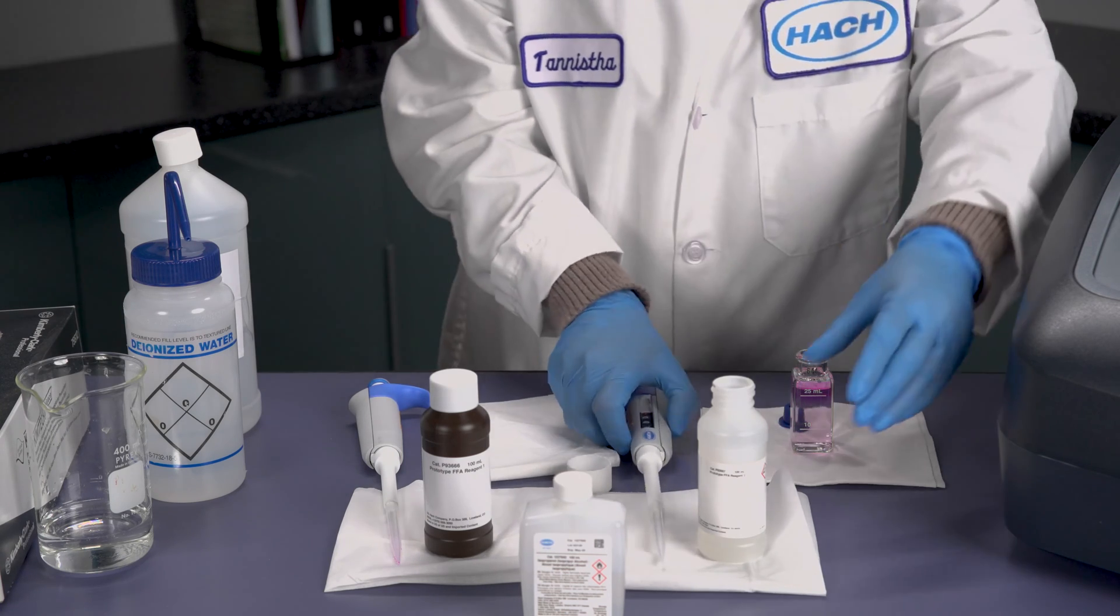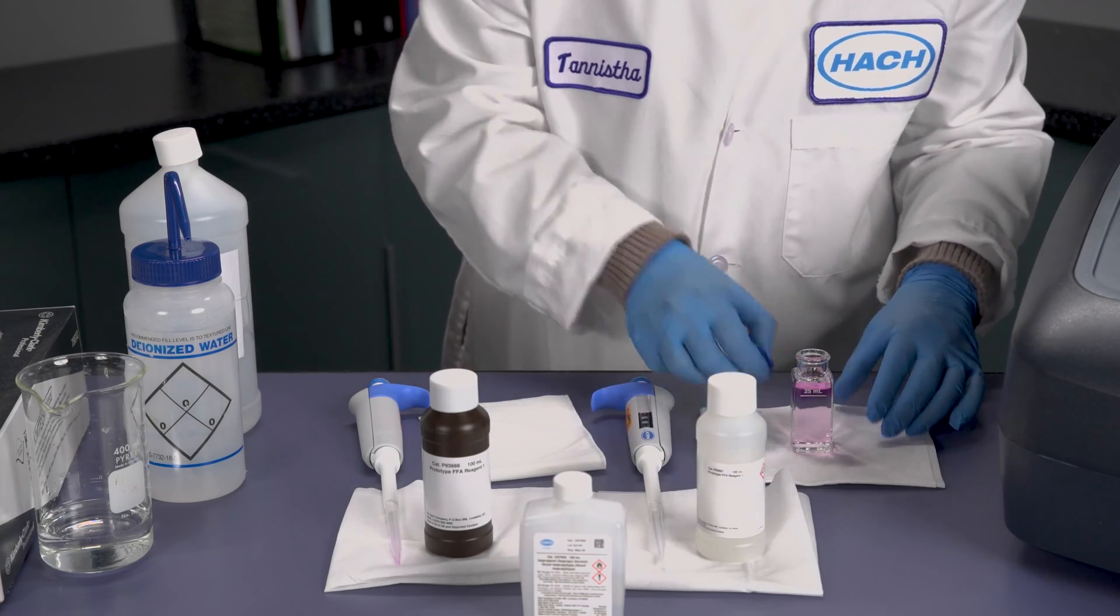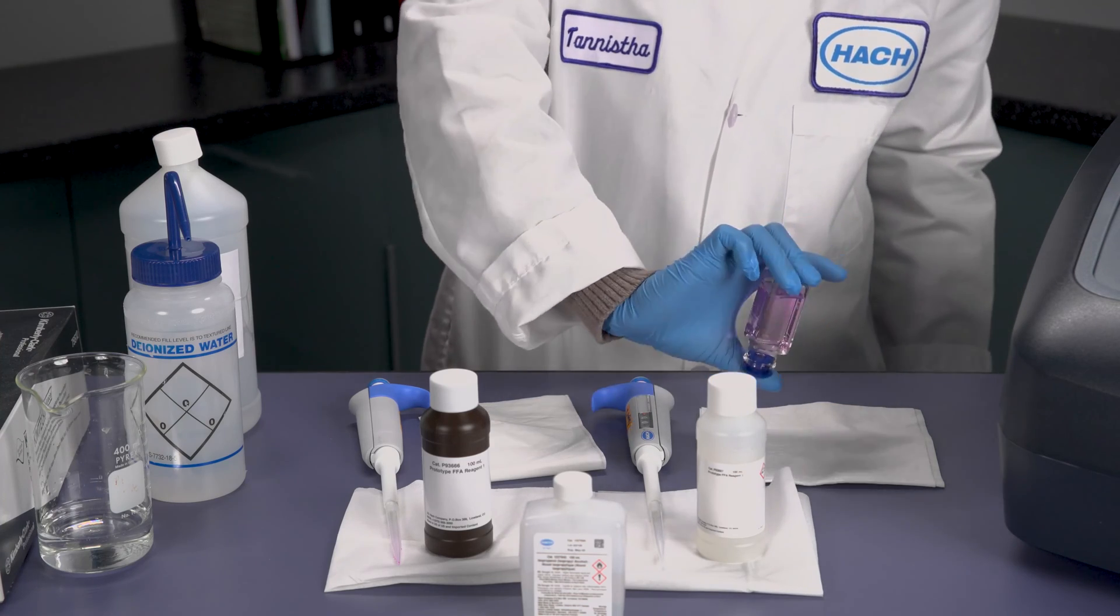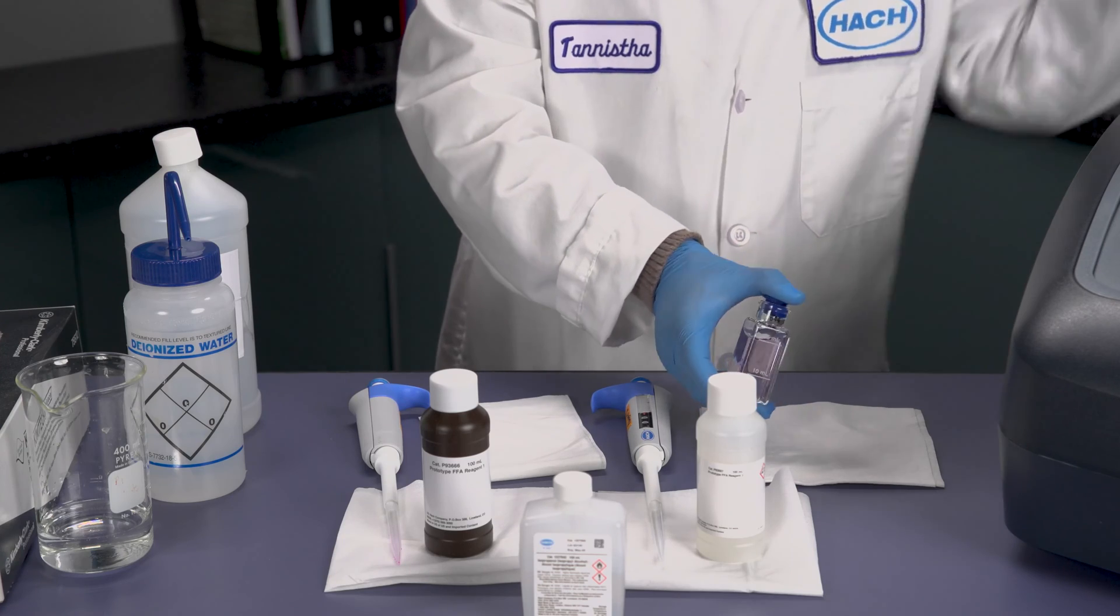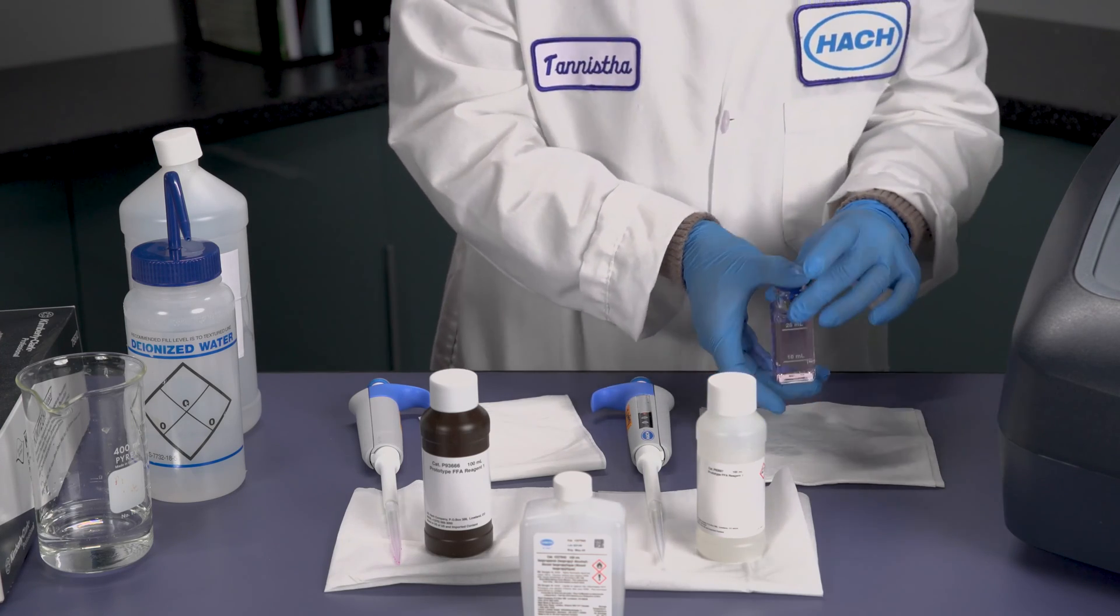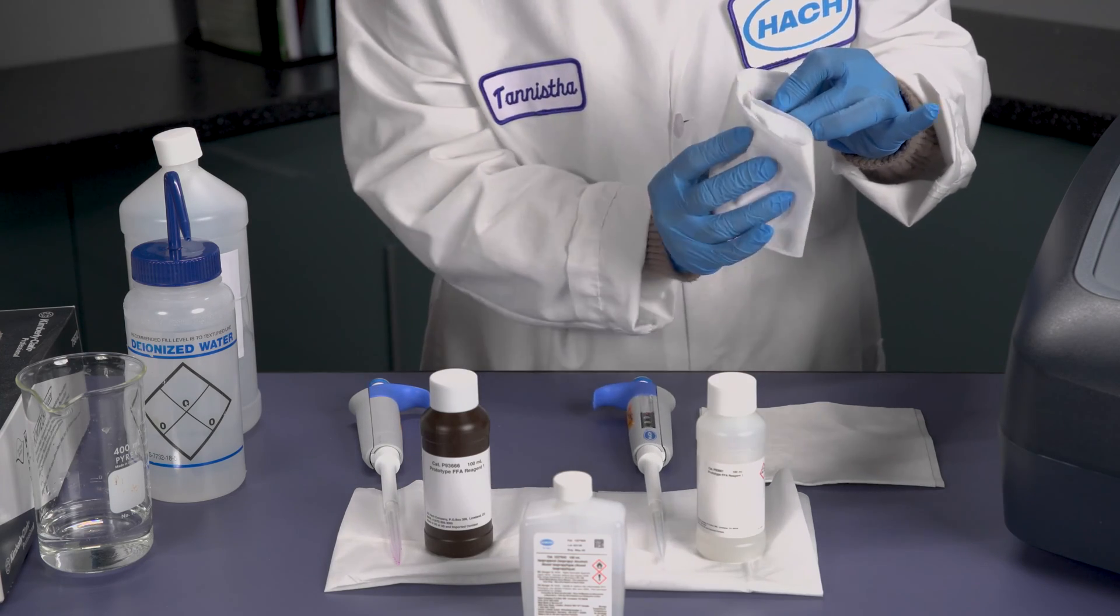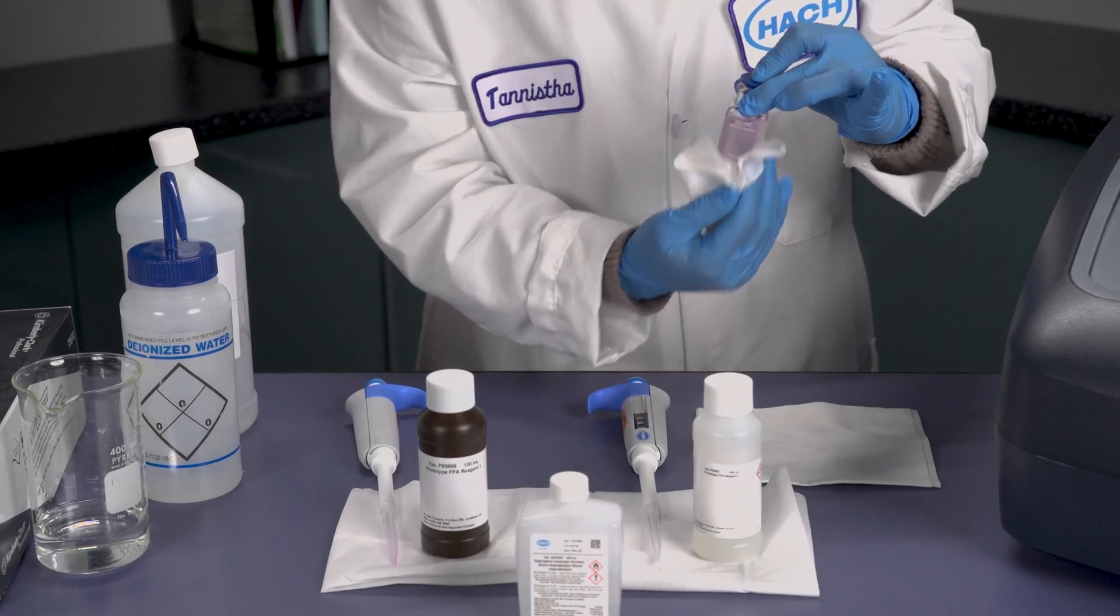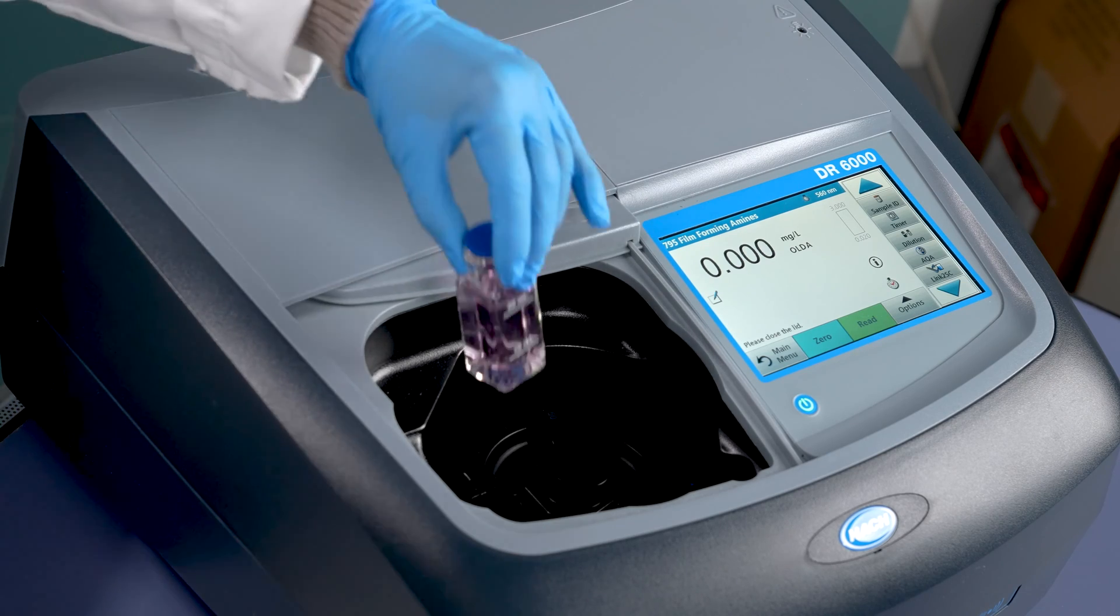Once the two reagents have been added, we will now add the rubber stopper and we will invert to mix. It is very important not to shake this sample. Only invert this sample to mix the reagents. Invert this four times for the best mix. At this point, we will set our timer for two minutes as a waiting period to allow the color to fully develop.